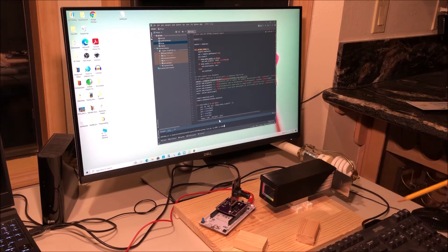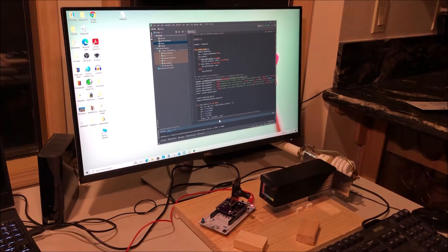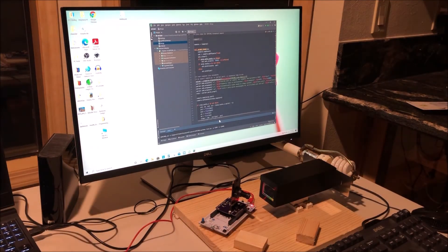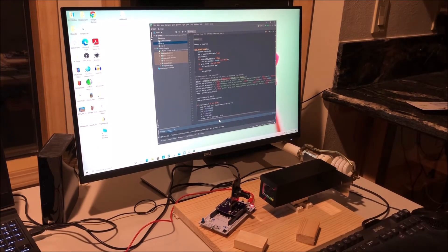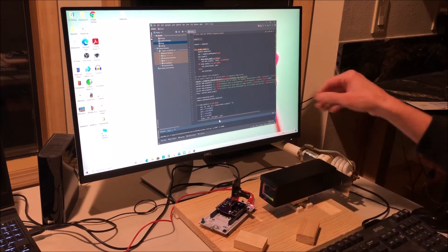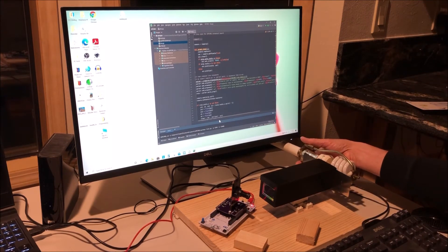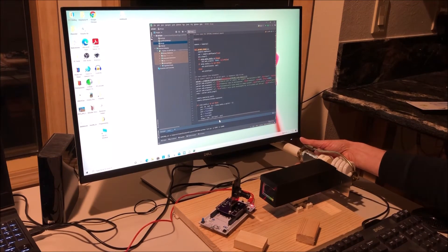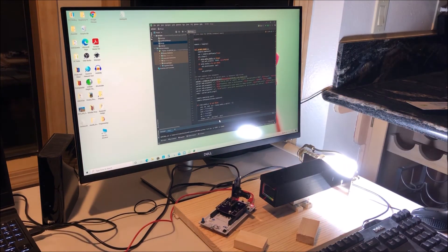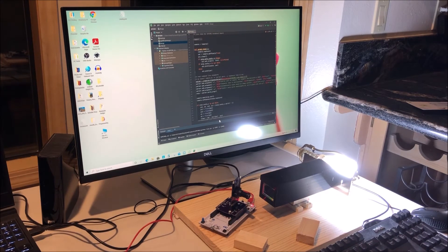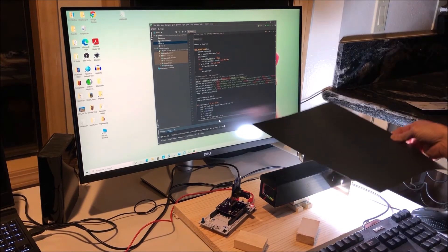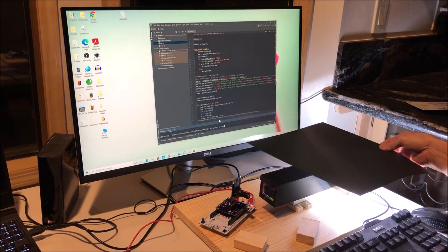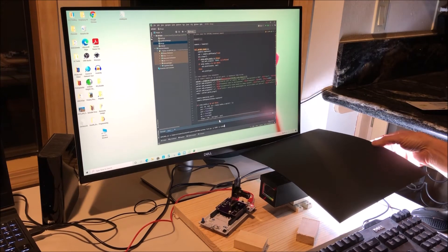So I'm going to turn off this overhead lamp now and turn on the CFL light. To keep from blowing everything out, let me just stick this over the lamp so we can see a little bit better.